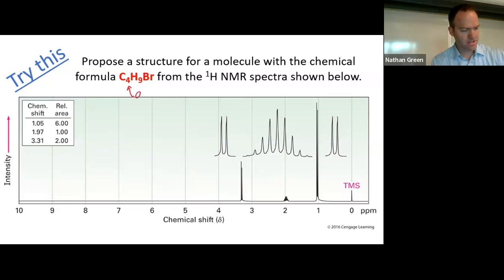We said that there were 0 degrees of unsaturation here. And then Rachel just said that we don't need to multiply anything here because 6 + 1 + 2 does add up to 9. So what I would do if I had this in front of me, and something I saw Caleb did, which is super handy, is you can write these down. You can annotate this and draw a little cartoon of this, so you're kind of keeping yourself aligned here. I'll work on the actual spectrum that I'm using right now.